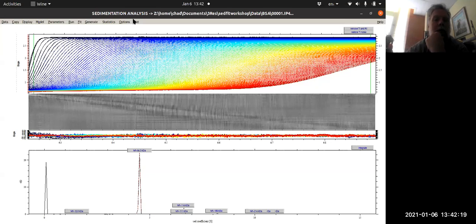To get back to your original plot, a lot of times you just hit run and it'll refit the data without the prior knowledge of the fact that your protein is monodispersed. And of course, because I have a resolution of 200, it gives you a set amount of data. Now, when you're doing your fit, you should make sure that you toggle between the different fitting options. You should toggle between different fitting ranges.